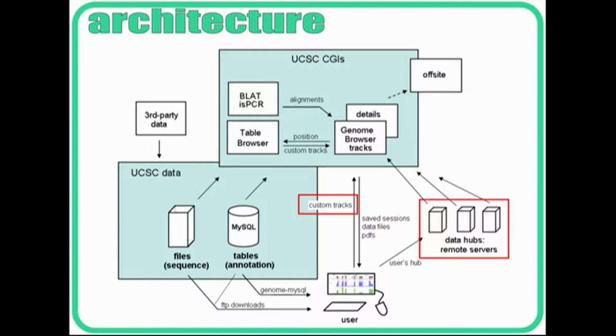So then your data are next to the browser, and you can load it directly into the browser. And I almost said go to the beach, but you can go out to the reservoir down by the river and work offline if you like. You would need to have access to UCSC if you wanted to load a fresh data set that you hadn't cached, because in that case, our data are now remote from you, and so the data have to be pulled in from the outside.